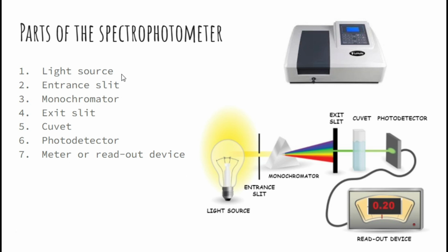Aside from knowing each part, let's make sure to memorize yung pagkakasunod-sunod po ng ating mga parts. Again, aside from knowing the different parts and their functions, please make sure to memorize the pagkakasunod-sunod of the parts of the spectrophotometer. In this way kasi, pag nakabisado niyo siya, mas makikita niyo po at mas ma-analyze niyo yung pinaka-function of each part.